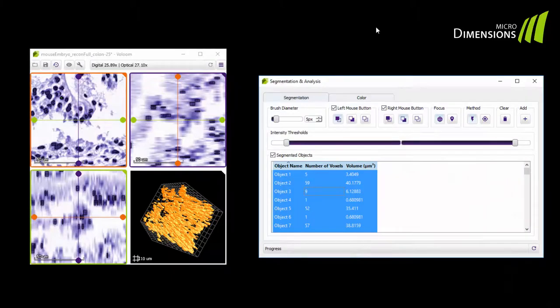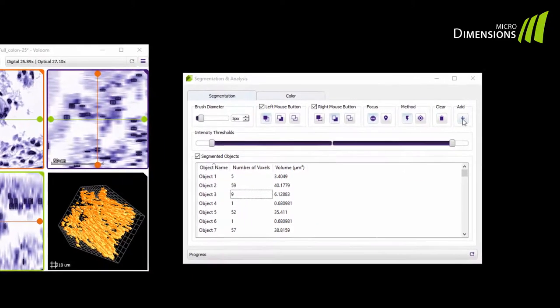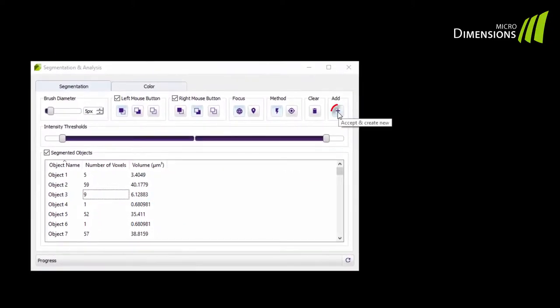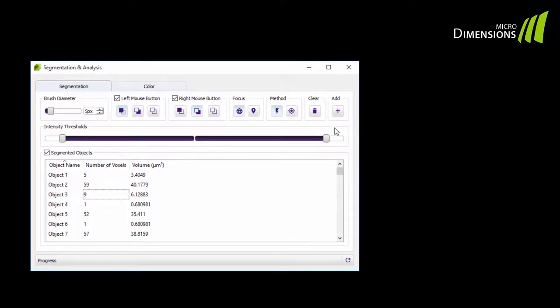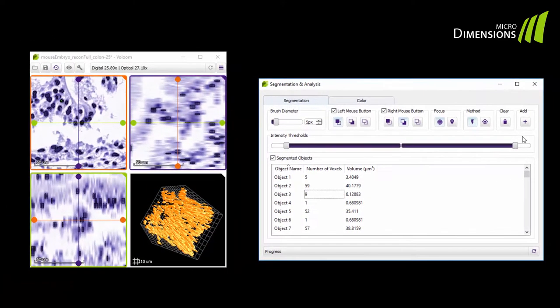If you want to save your segmentation results, just click the add button in the segmentation toolbox and the current segmentation is accepted and can be visualized along with your volume. Segmentation results accepted like this will also be saved with MicroDimensions Volume and they are accessible through the visualization options and geometry tab.